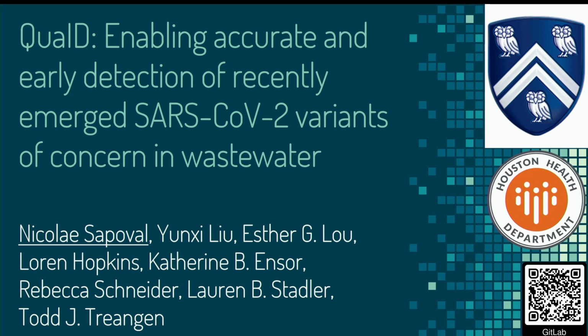Hello, everyone. Today I'm going to be talking about QuaID. It's our tool for detecting and characterizing the variant of concern lineages present in wastewater.